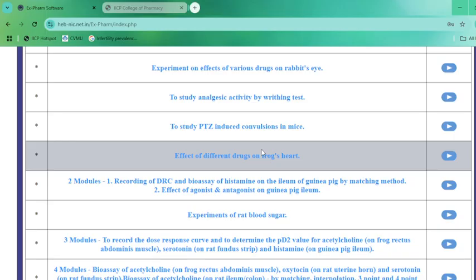Also, any experiment can be conducted quickly, anytime and anywhere in the computer labs, overcoming logistical constraints. So, despite dealing with animal obstacles, we can easily access this software any place, at any time, with quick responses. Also, it helps in revising practical procedures before the exams, building confidence and accuracy in explaining experimental pharmacology. The students can easily understand the practicals if they are not aware of any single practical. They can operate this software and understand the procedure as well as the principles, observations and results regarding the specific practicals.